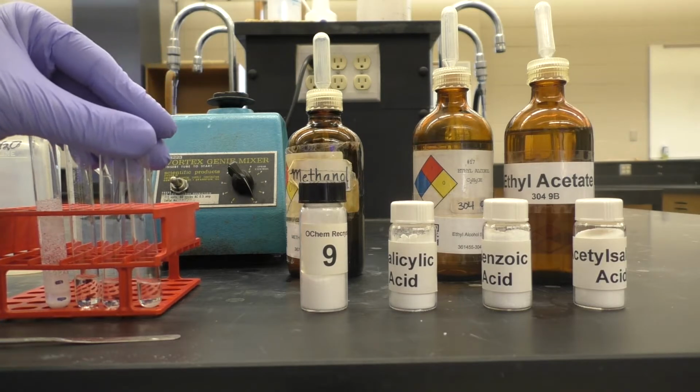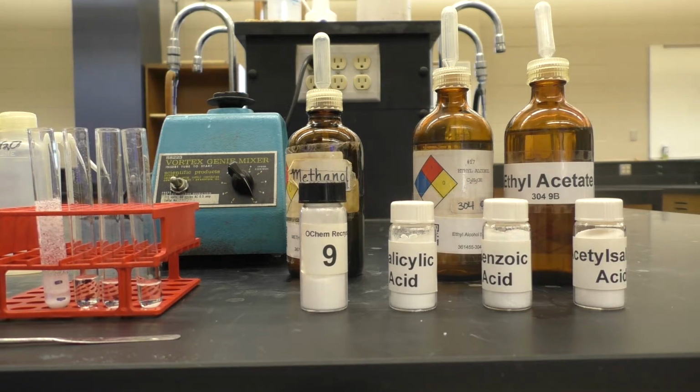So of these four, what we would normally do now is test the solubility of the various compounds in these solvents at elevated temperature.